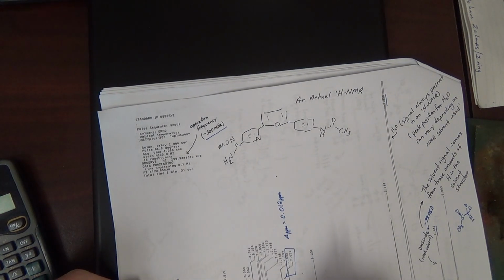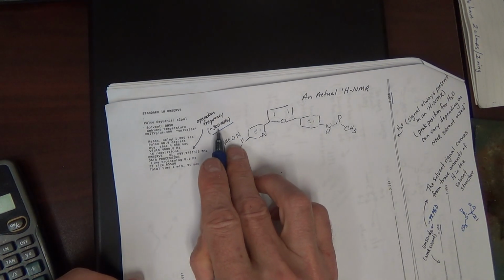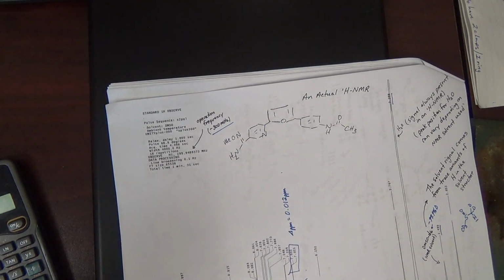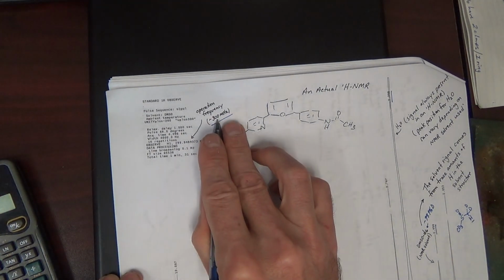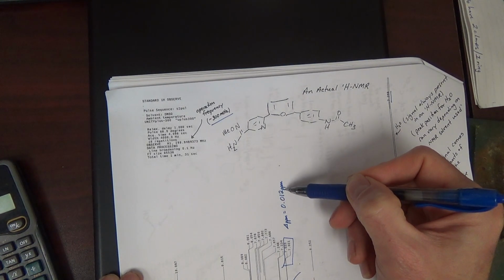500 megahertz is sort of the top entry level. 800 megahertz effectively means a bigger and bigger magnet. It leads to greater sensitivity. We'll talk more about that. But as this changes, ppm would change if your J values were given in ppm.